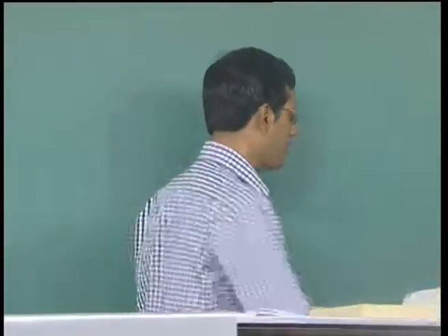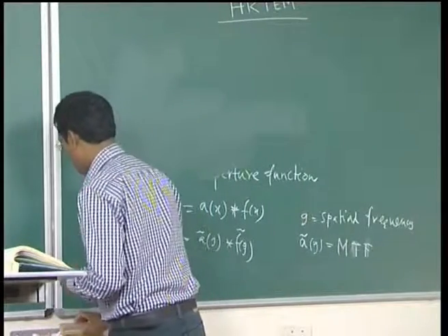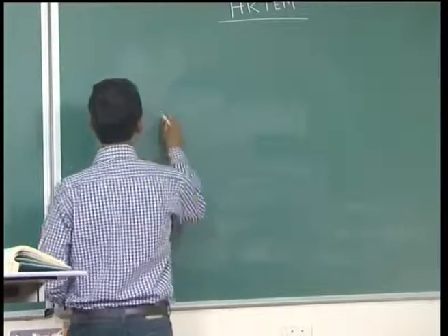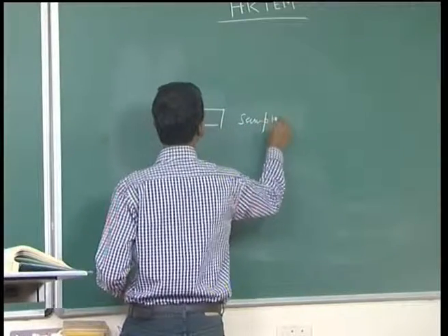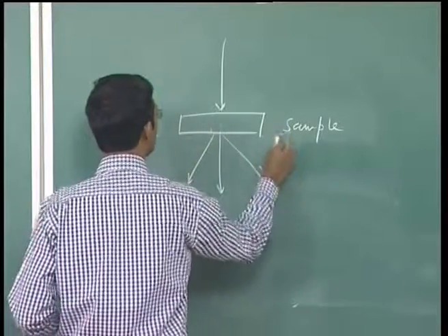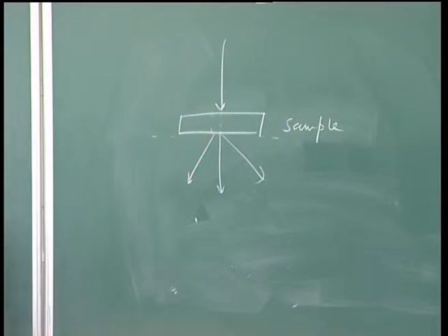Whenever we think of an object, or sample, in electron microscopes, we know that the electron beam falls on the sample and passes through it, because it is a very thin one. So, this is a sample in the electron microscope, and the electron beam falls like this and interacts, and then either gets diffracted or does not get diffracted through this exit plane. This is what happens in the electron microscope, as I discussed with you in the class before.